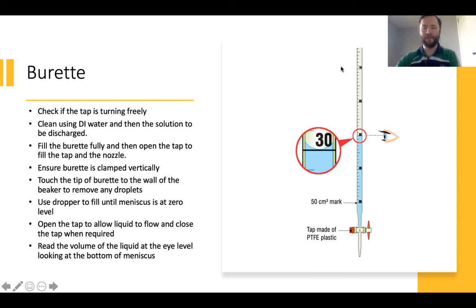Then we open the tap and allow the liquid to flow, and close the tap when required. Here we just have to be very careful that we carry out the reaction slowly and carefully, close to the endpoint of the titration, so that we don't miss the endpoint.